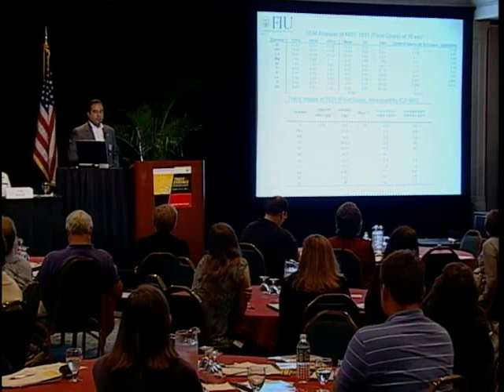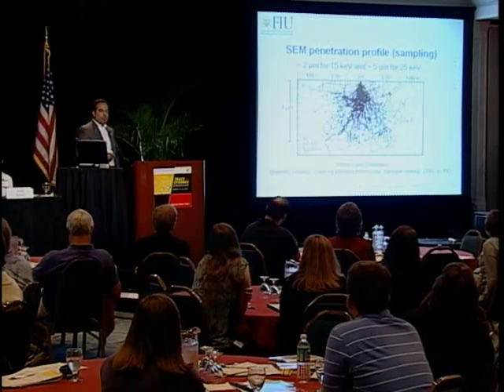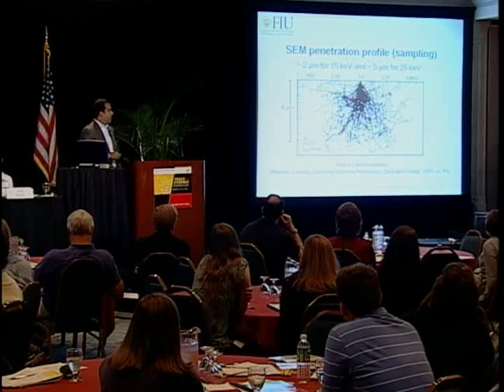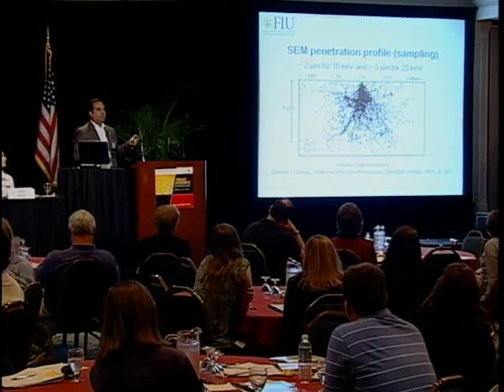And though that element list that I mentioned is very discriminating, iron doesn't show up on the list of elements that you can detect by SEM. The second problem with SEM is that it's considered more of a surface technique. So we can only sample a very small depth into the sample. Remember I said you need at least a 30 by 30 by 30 cube in order to characterize a sample of glass well. So the people who are doing SEM EDS really need to sample in many different locations, in order to average the concentration across many samples.